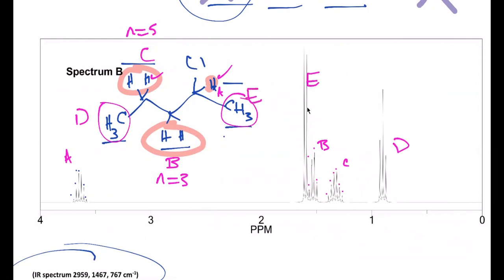Go ahead. Okay, so to jog my memory, how do you know when the hydrogen is supposed to break? Because you remember last time, it'll be a hydrogen that breaks, so it'll count its left side separately from its right side. Like what we just did with the complex splitting? Yes, but then how do I know? Because that hydrogen next to the chlorine, you just added up the CH3 plus 1 and then the doublet plus 1. Right, right.